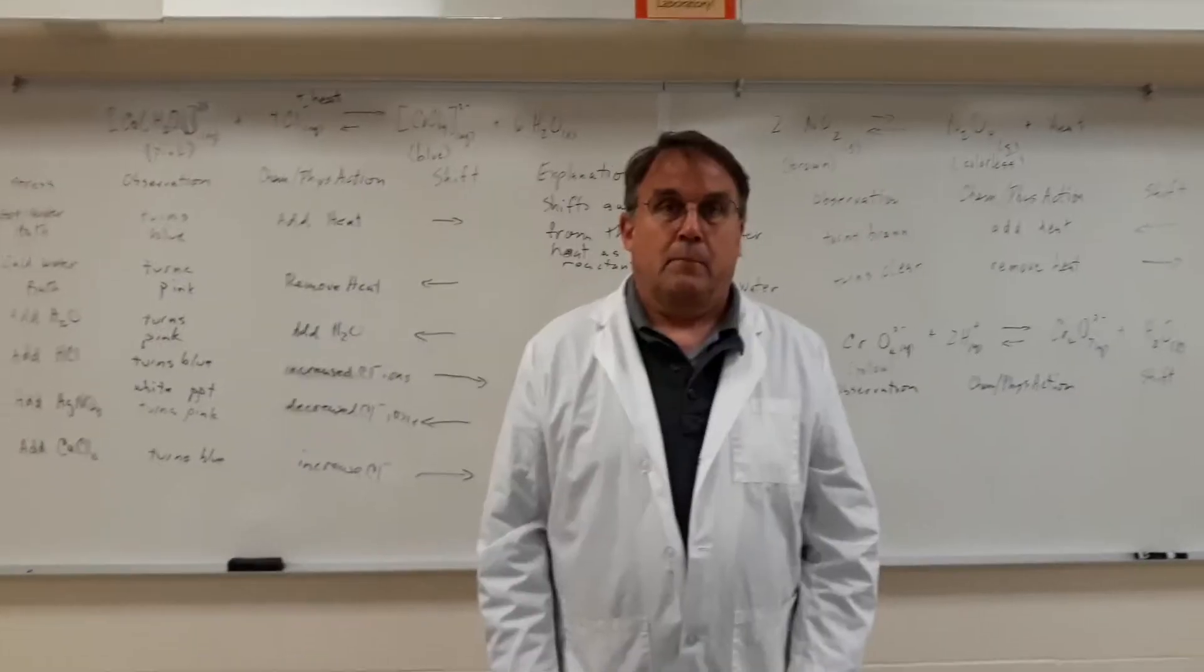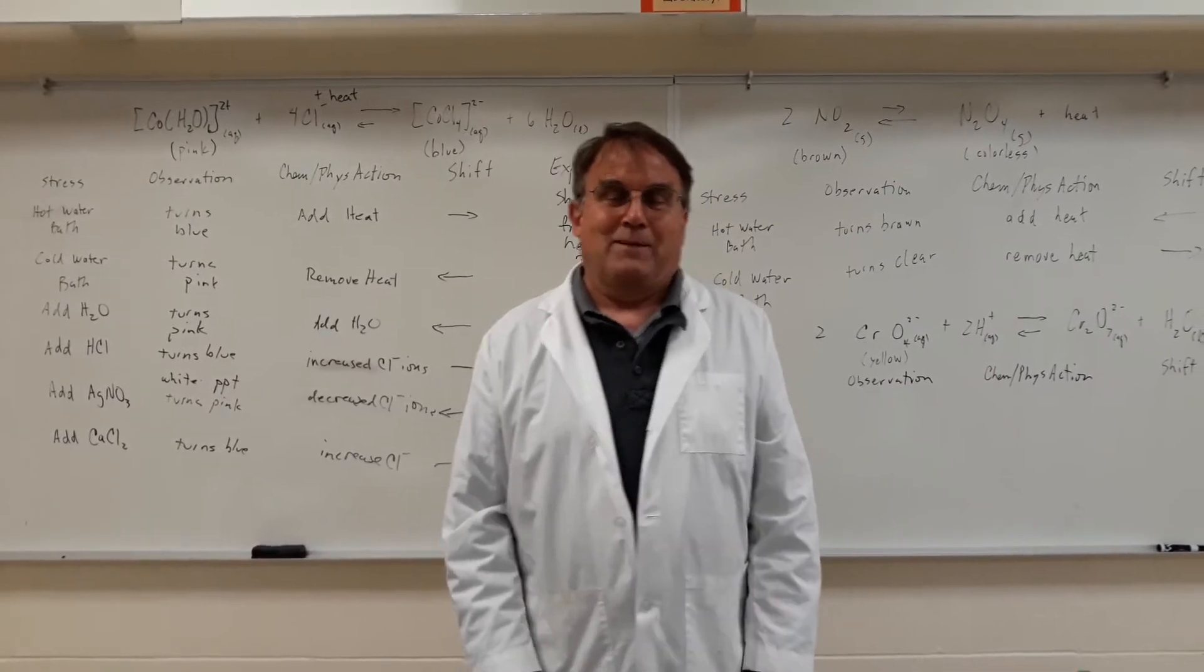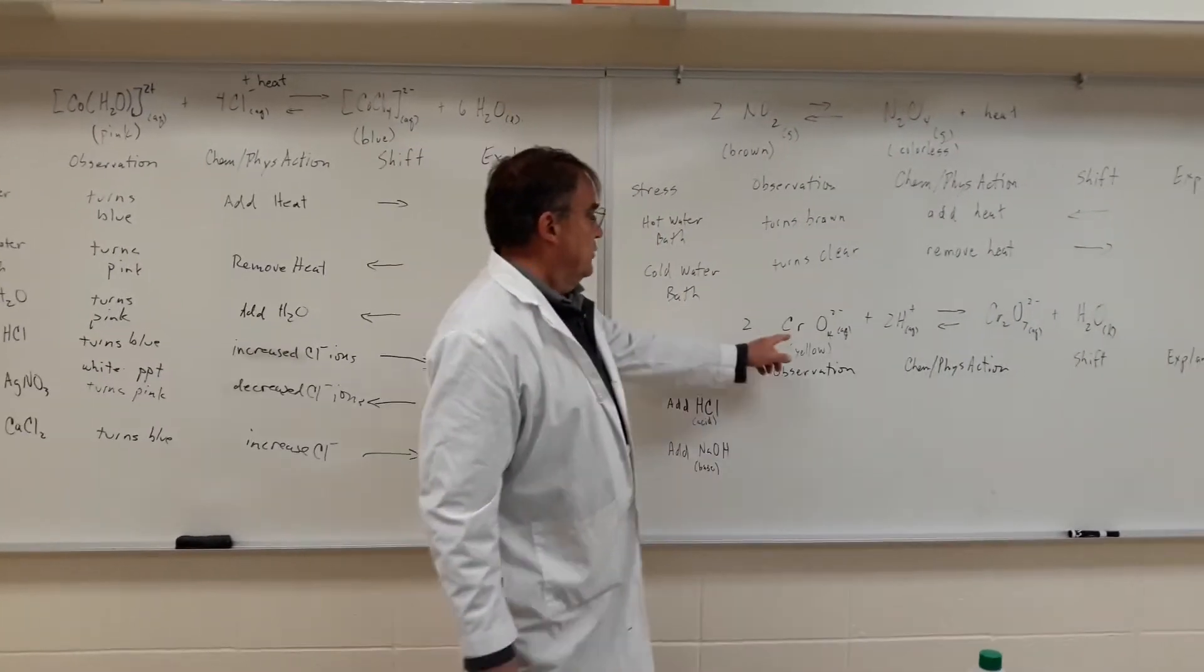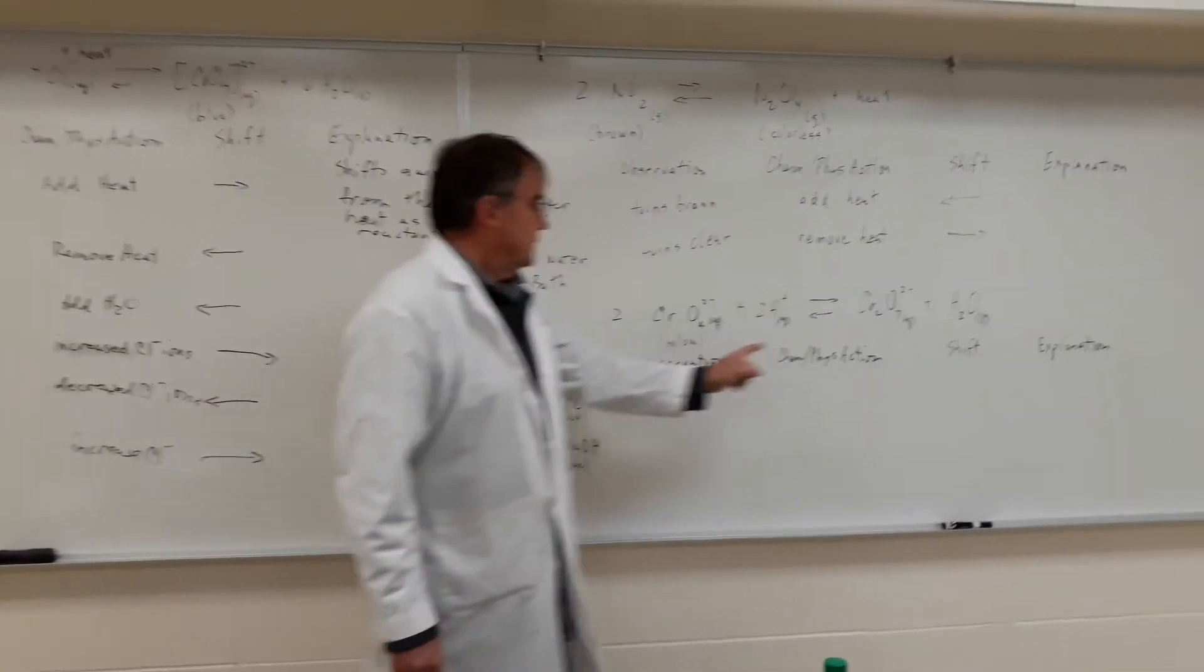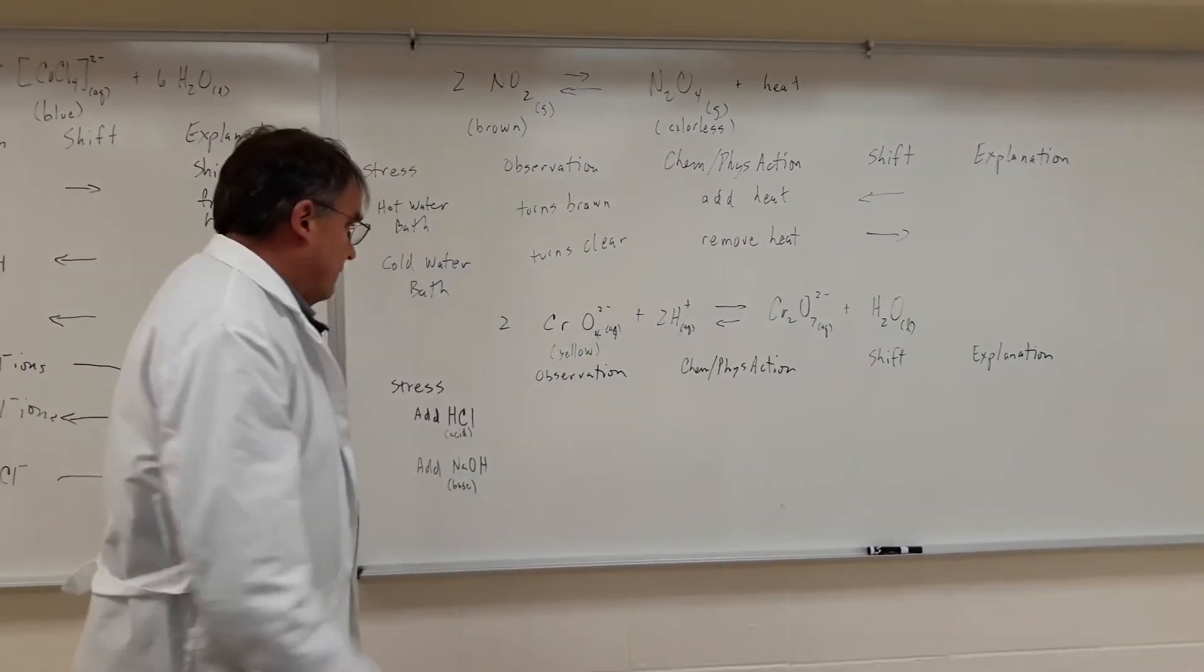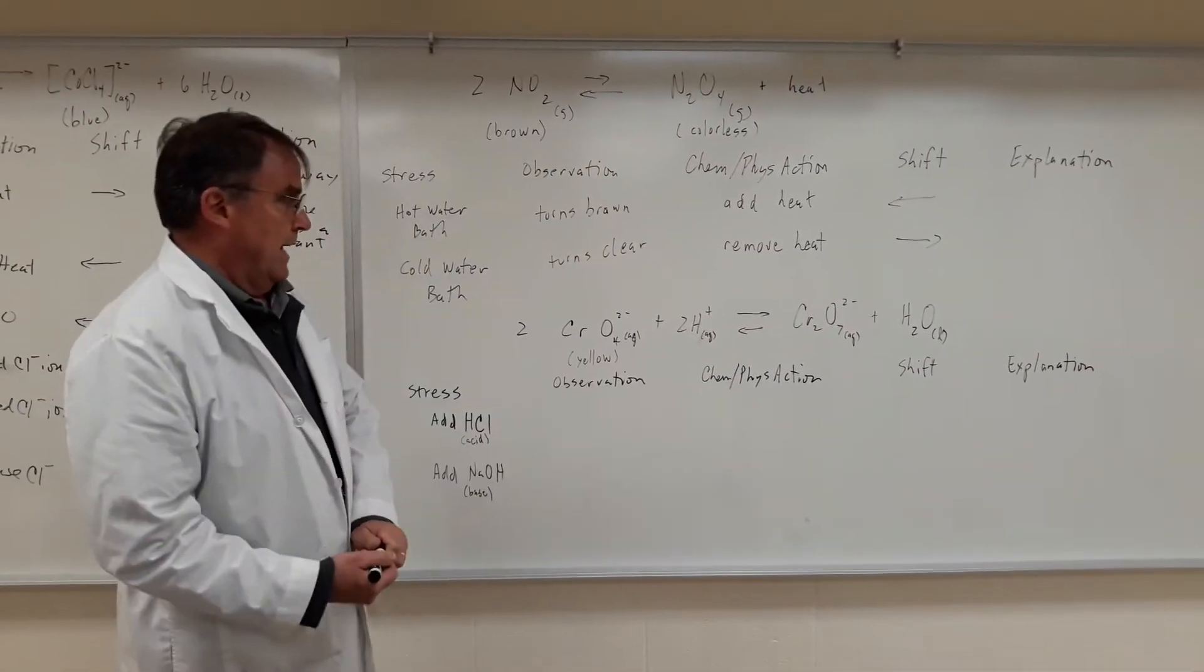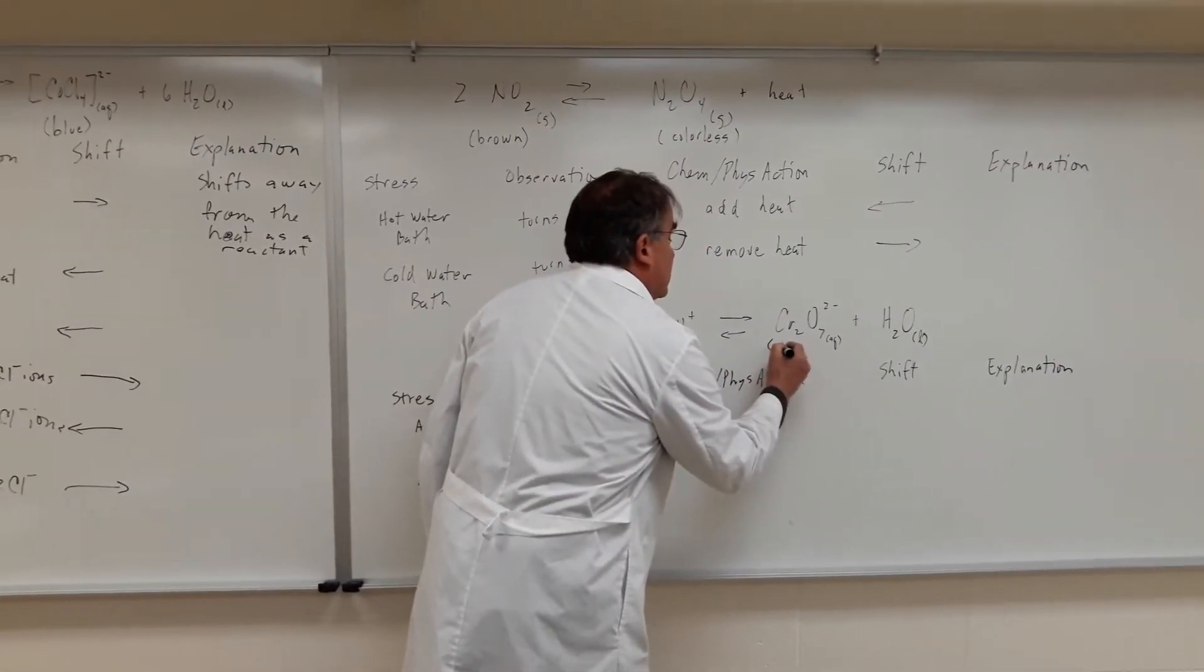Awesome. So the last equilibrium we are going to stress out is the equilibrium between two common all atomic ions, the chromate ion and the dichromate ion. First of all, the chromate ion is a vivid yellow. And the dichromate ion is a very bright orange.